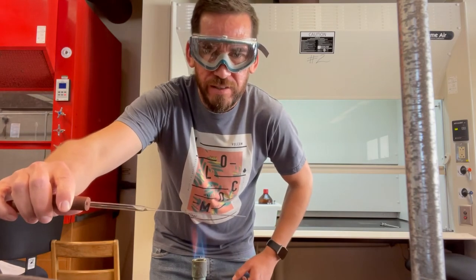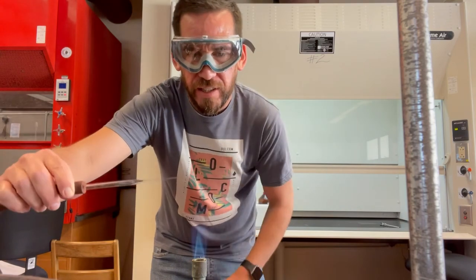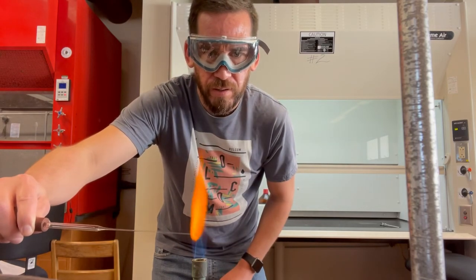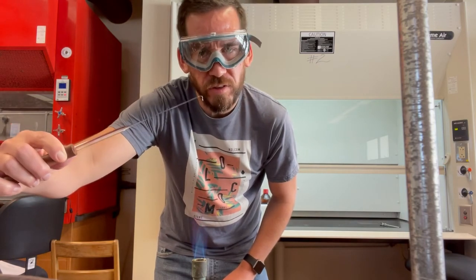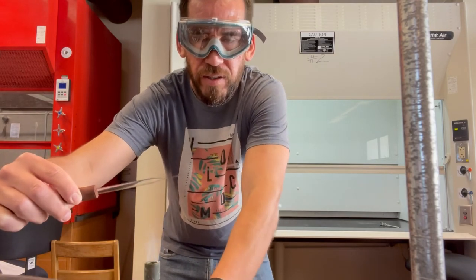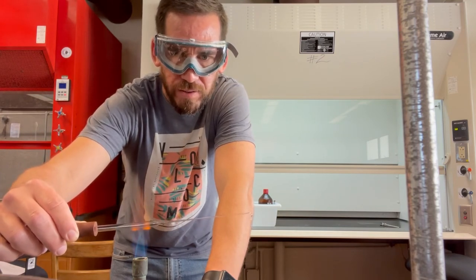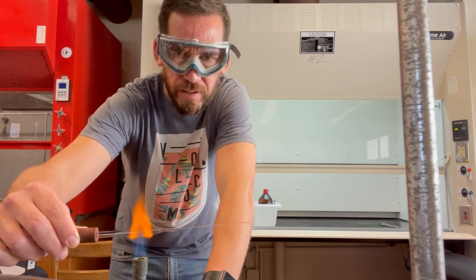So we can go ahead and seal this end off. I'm pulling a vacuum on this. It's not a great vacuum because this doesn't perfectly connect. But once you seal off the end, let me just do this tip right here. Okay, I don't hear the noise anymore, so it's sealed off, right? Once you start hitting the middle part though, since it's pulling a vacuum, it starts to get sucked in instead of just normal melting. Let's see if it works, because the vacuum, like I said, is not amazing on it.